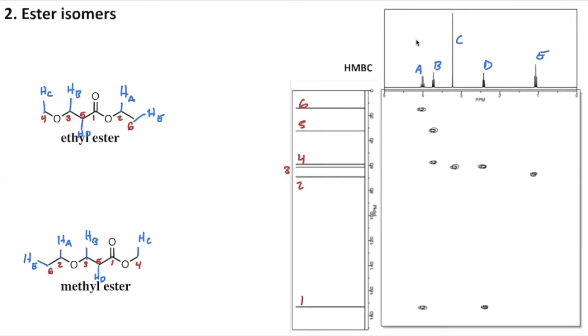For these, I'm going to take a little bit of a different approach. I'm going to draw just a long line in blue for the hydrogens and try to match it up with the edge of this spectrum so that I know that it's straight and that I can just move it along to each possible peak so that I can see any correlations all the way down the length of the spectra.